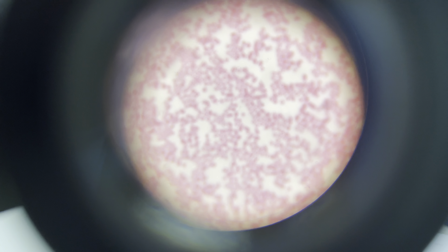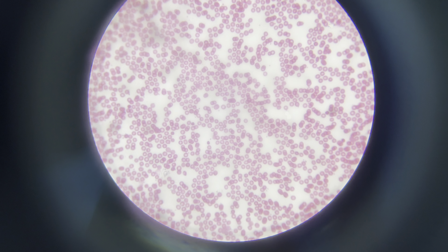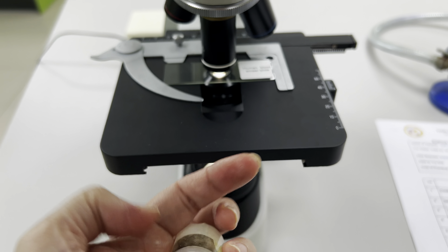Next we need to switch to the high power objective — rotate to the 40 times objective. Locate the desired portion of the specimen in the center of the field. Refocus very carefully so that the specimen is focused as sharply as possible.